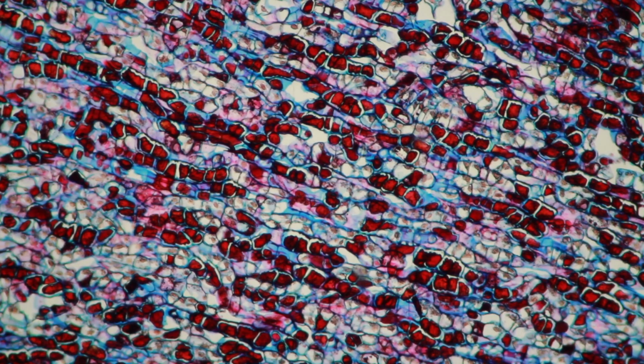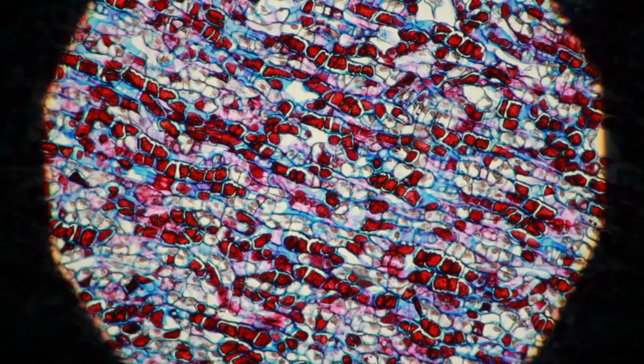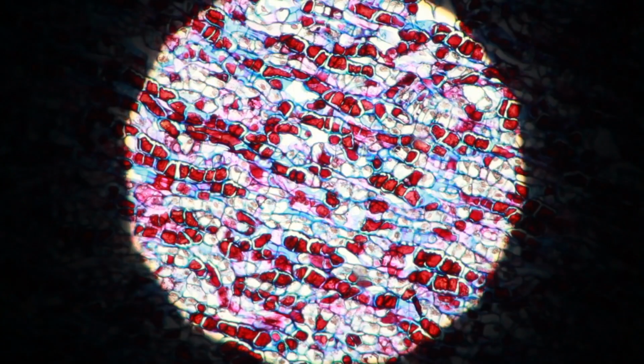So these are now some cells, and when you close the field diaphragm, you can see that if it's closed too much, you can actually see a circle. The corners of the image are then dark and black, and what you want to do is open it just enough that you do not see the circle. And there are also centering screws, and I'm now trying to center the field diaphragm.